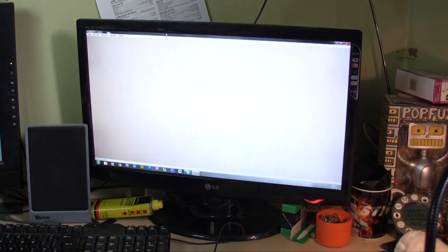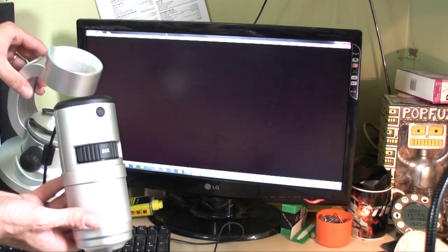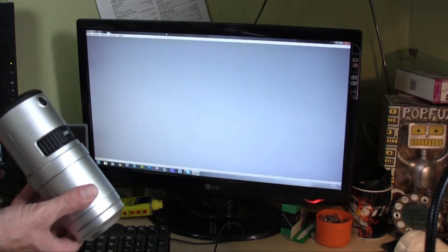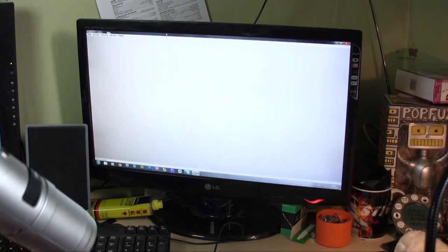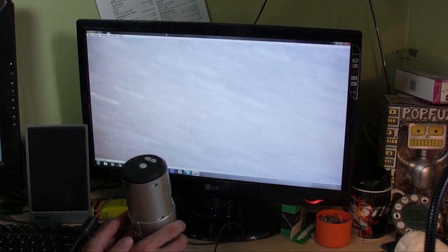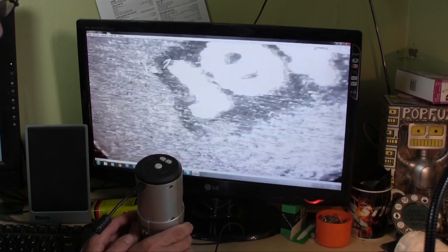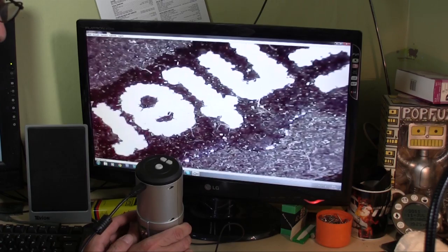Another thing I like about this is the top, as you see, comes out of the base — there's the base there. Which means you can have a look at things that don't necessarily go under the microscope. So let's have a look at my Enter button on my keyboard. There we have an Enter button — let's find the Enter sign. There we go — Enter. Okay, it's upside down and backwards, but Enter.